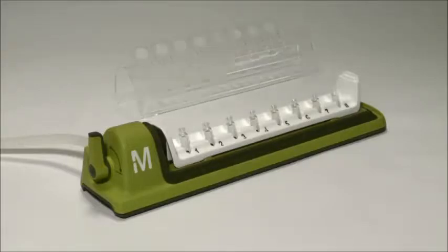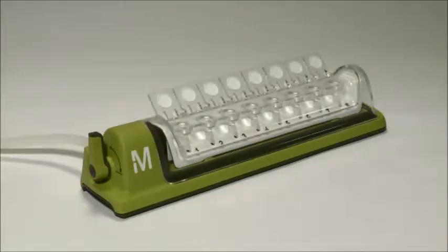Next, put the lid on, making sure it's flush against the unit. This clear cover makes it easy to see your sample throughout the filtration process.